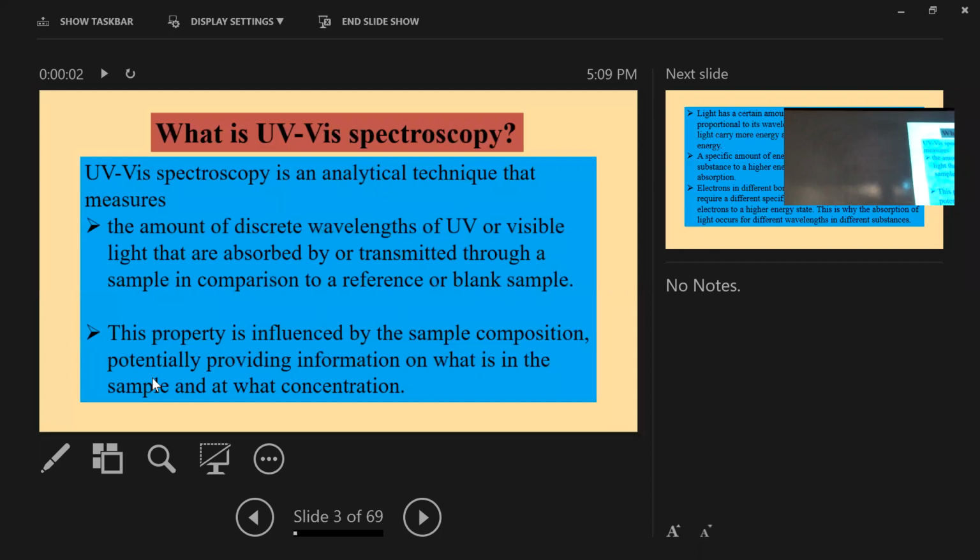But if I increase the layer, right now it is very difficult to see something. You cannot see anything. But if I add only a single layer, you can see some shade. Maybe you can see from this side. But if I use two folds, you cannot see anything.